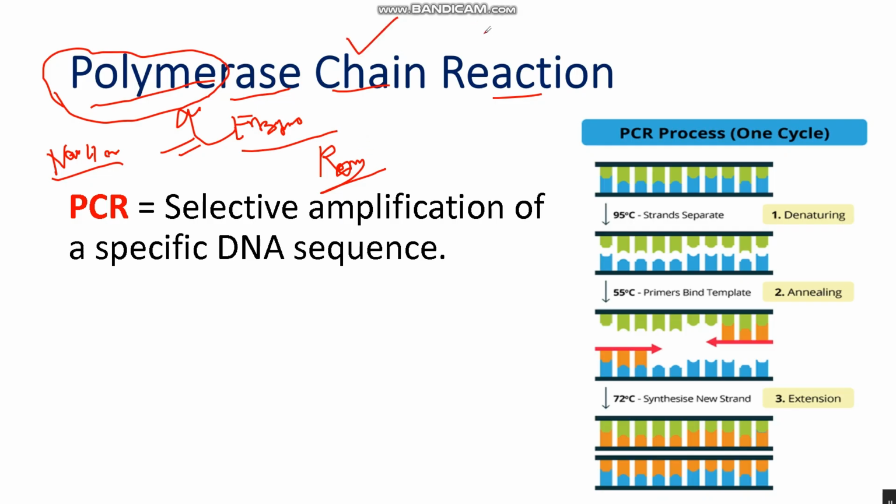And the words chain reaction refer to the cycle that is repeated 30 to 40 times.